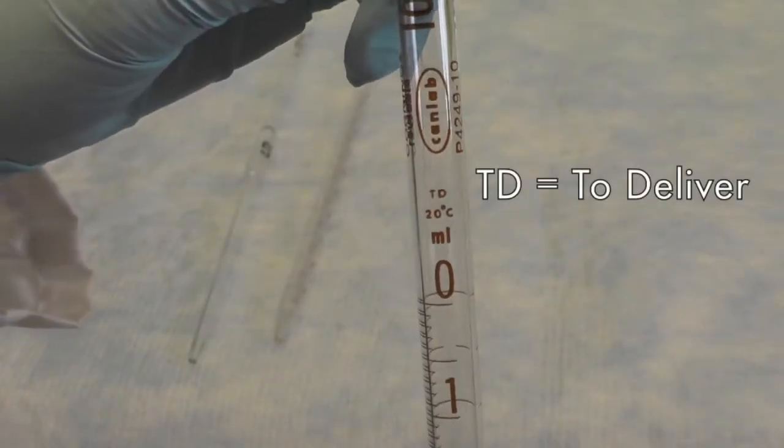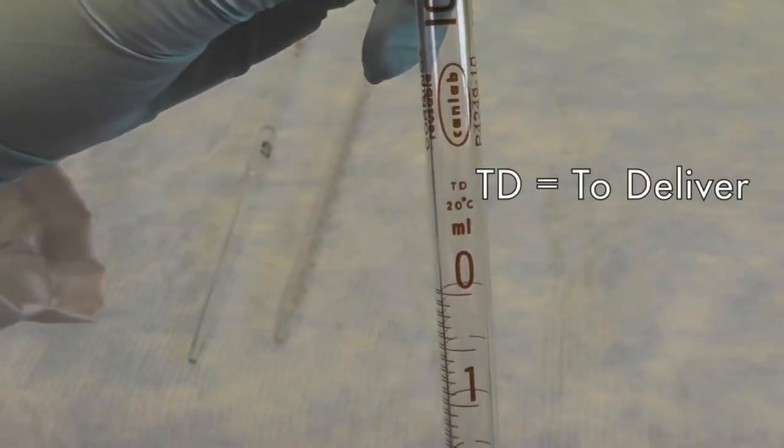All of these pipettes are considered to-deliver type pipettes, as noted by TD on the pipette. To-deliver pipettes do not require rinsing to obtain the exact volume of the transfer solution compared to the to-contain type.